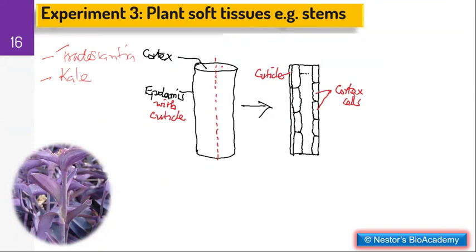And if I can explain this briefly, even if we were to give you the Tradescantia, you might be expected to cut off maybe 2 centimeters from this end, and then when you cut it out, you will obviously get something of this nature.